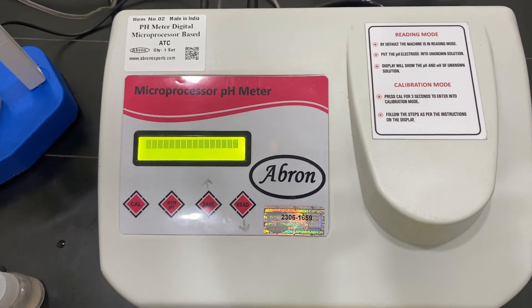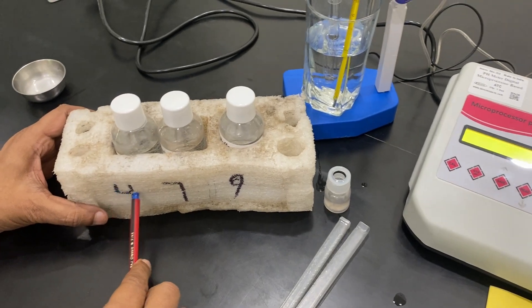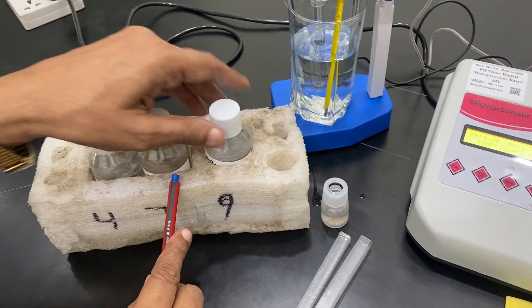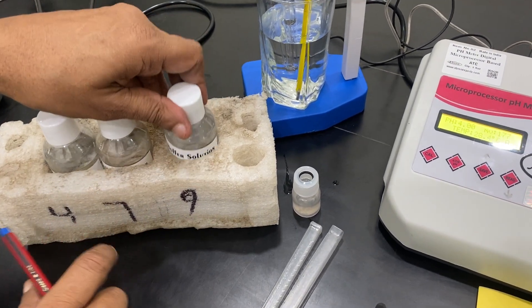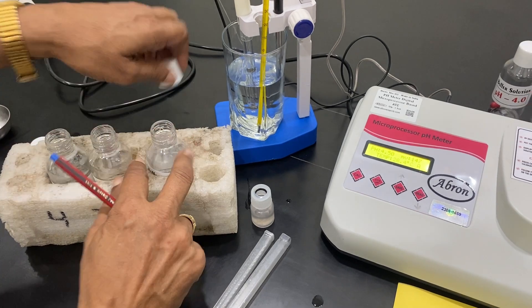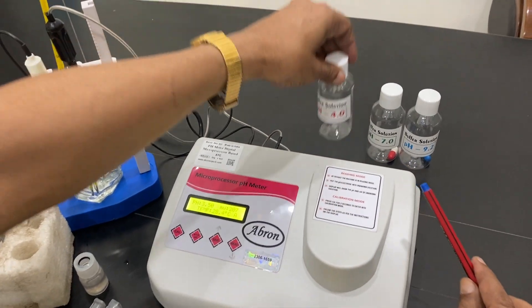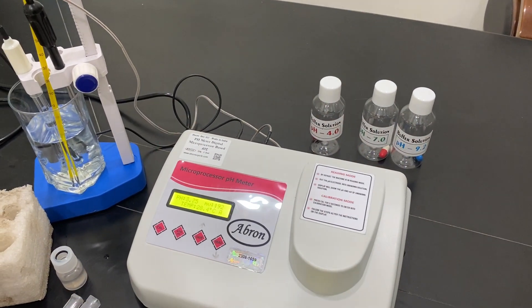For pH calibration, there are solutions of pH 4, 7, and 9. We have just prepared the solution of 7, solution of 4, and 9.2 is there. Freshly prepared 100 ml solutions are made using the bottles with capsules. These capsules come with the instrument for three-point calibration.